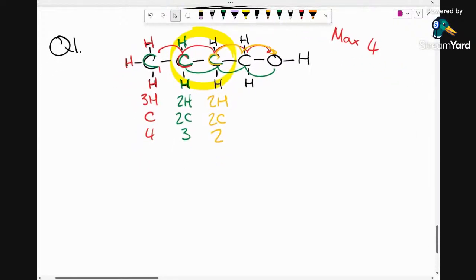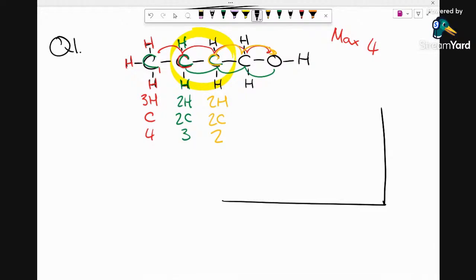Just to quickly give you an insight of this, we'll be doing data on this in a separate lesson. We'll be doing NMR graphs, by the way, in the next lesson. This is chemical shift down here, chem shift in parts per million. And this here is TMS. There is technically no y-axis, by the way. The green carbon, this one here, is going to be closer to TMS than the yellow one would.